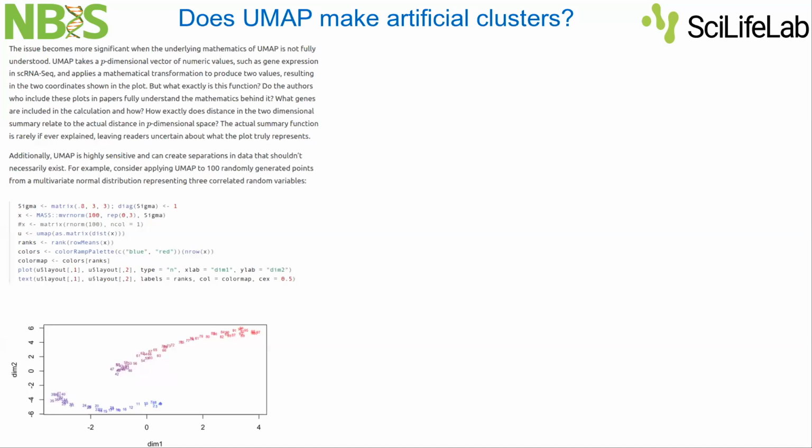Yeah, but when we did the doublet predictions, usually the doublets were in the bridges. Of course, I agree it was very low quality, but I'm just pointing out that it could be interesting.